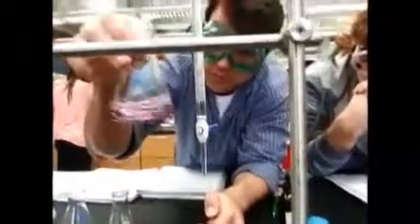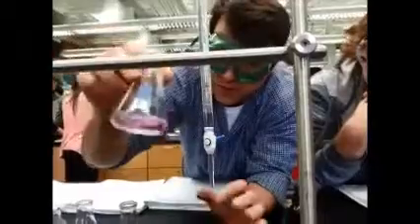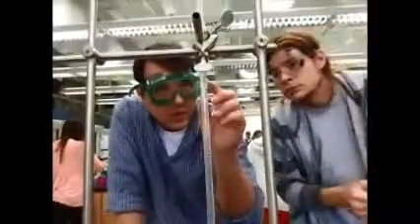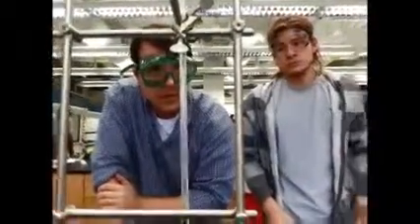Here we see that this persistent pink color means that the dye has changed color. The indicator indicates that the endpoint is reached, so we will no longer titrate. Final volume is 20.81.